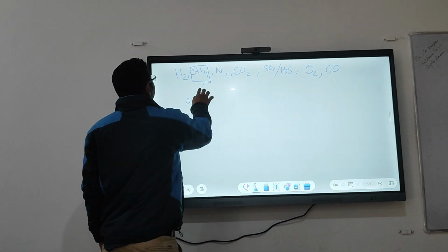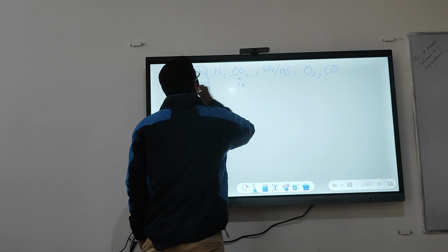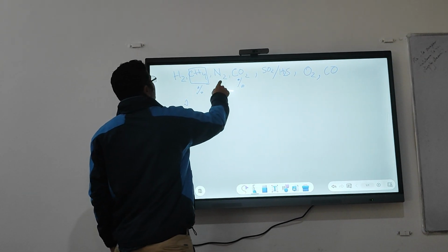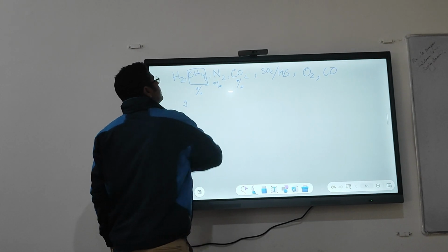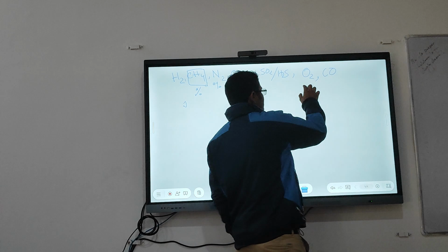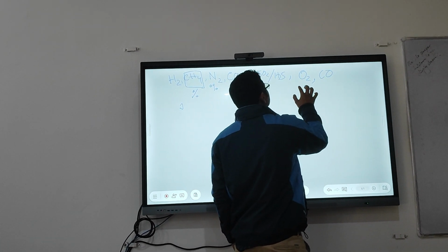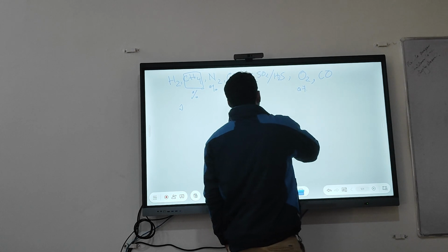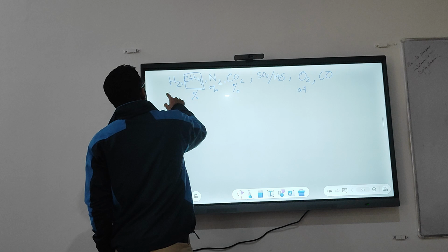These are percentage level. Nitrogen also. Oxygen 0 to 1%. It is also 0 to 1%. Same, 0 to 3-4%, 2%.